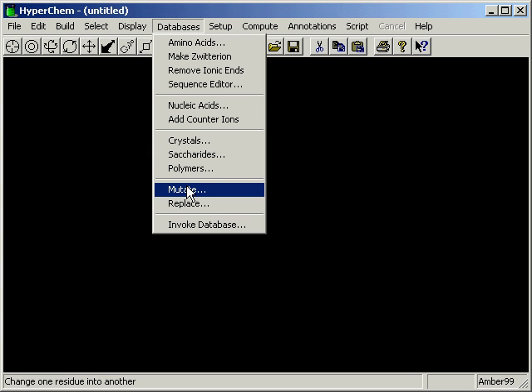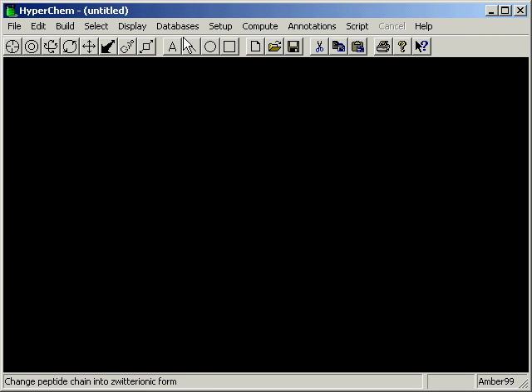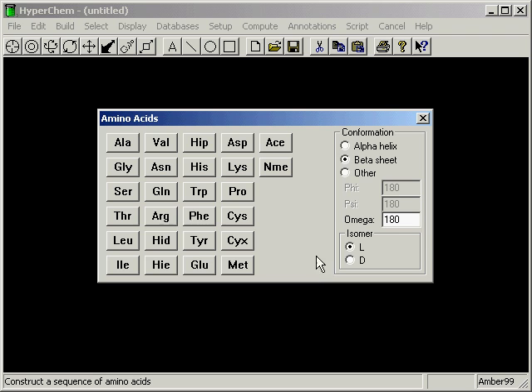However, it doesn't give you the generic operation of taking an arbitrary sequence of arbitrary length and replacing it by a different sequence with different length and/or composition. So that's the replace operation which we're going to illustrate. To do a replace operation, we first of all need the source sequence of residues, and we prepare those in advance. So we go up and let's choose a small sequence.